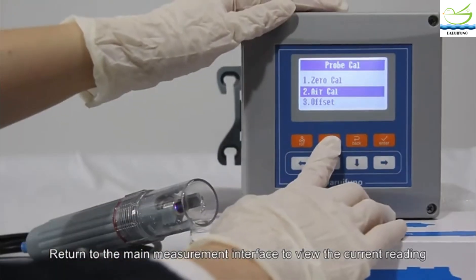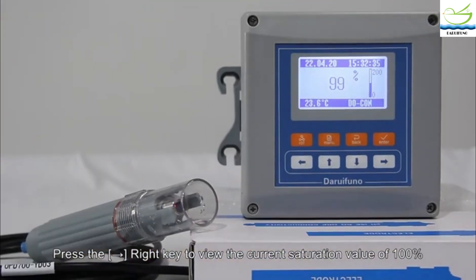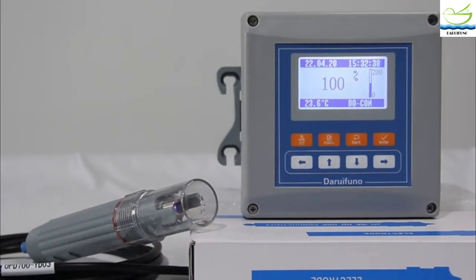Return to the main measurement interface to view the current reading. Press the right key to view the current saturation value of 100%. Now the air calibration is finished.